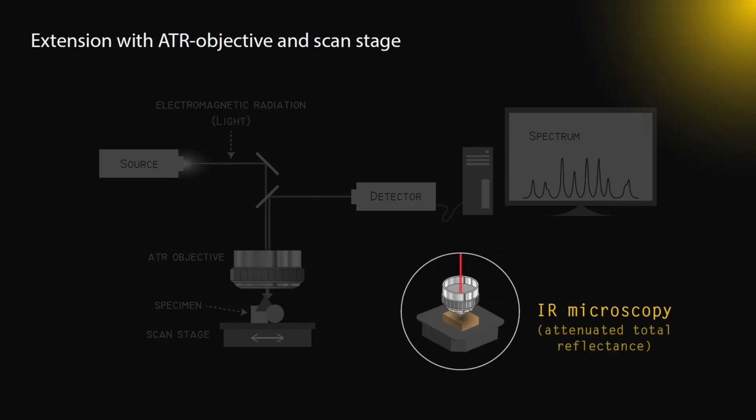In comparison to transmission and reflection mode, spectra with high signal-to-noise ratios can be obtained, given that the crystal tip is in intimate contact with the specimen. Be aware that this means that this is not a contact-free method. Depending on the probed material, visible indentations can be produced, which can be problematic when working with delicate materials. Depending on the material, its refractive index may also prohibit the use of the method.